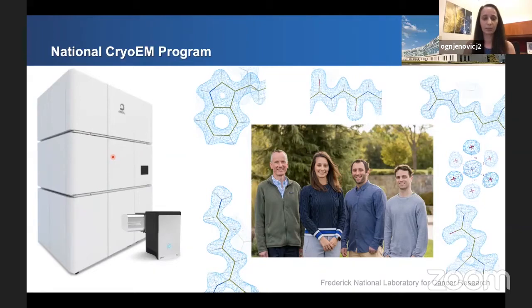And the goal here was to use this combination of hardware highlighted by the cold FEG to produce structures that would have density displaying some ultra high resolution features, such as those shown on the slide here around the picture of our team.